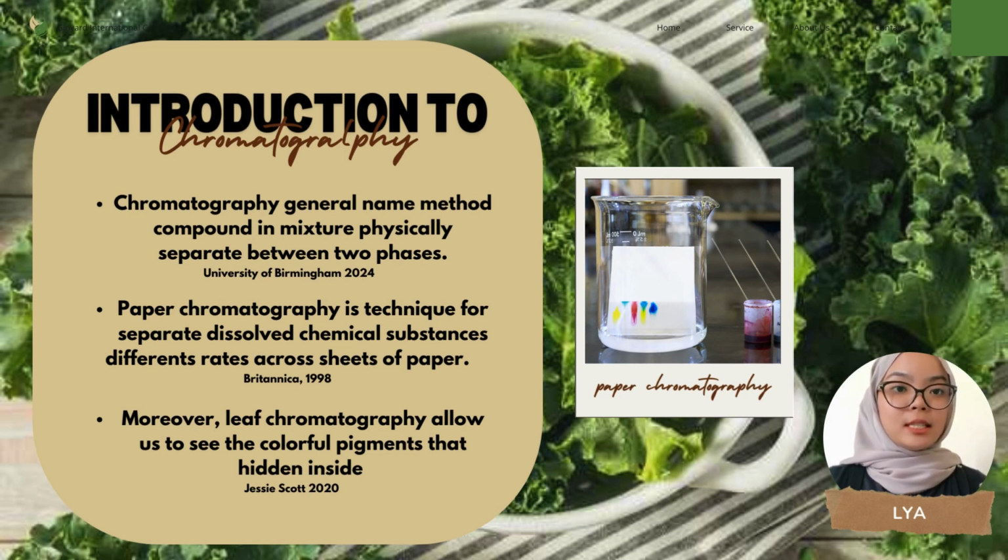Chromatography is a general method in which the compounds in a mixture are physically separated between two phases. Next, paper chromatography is a technique for separating dissolved chemical substances at different rates across a sheet of paper. Moreover, leaf chromatography allows us to see the colorful pigments hidden inside.